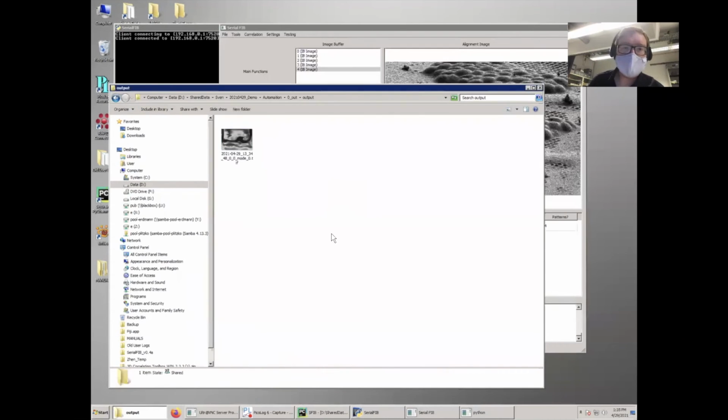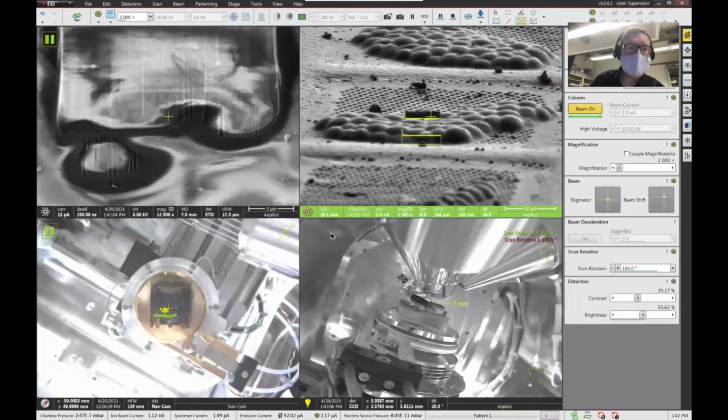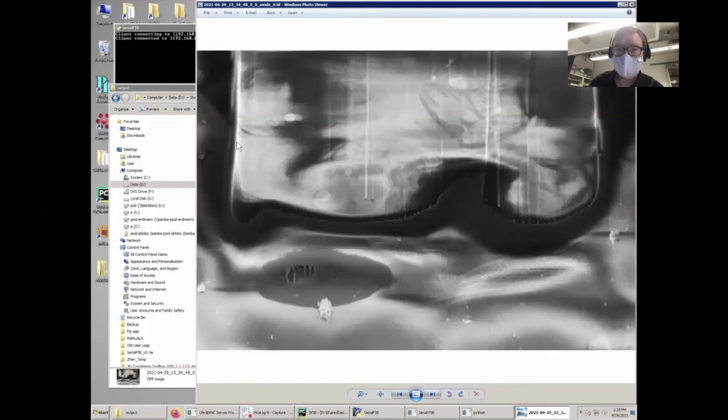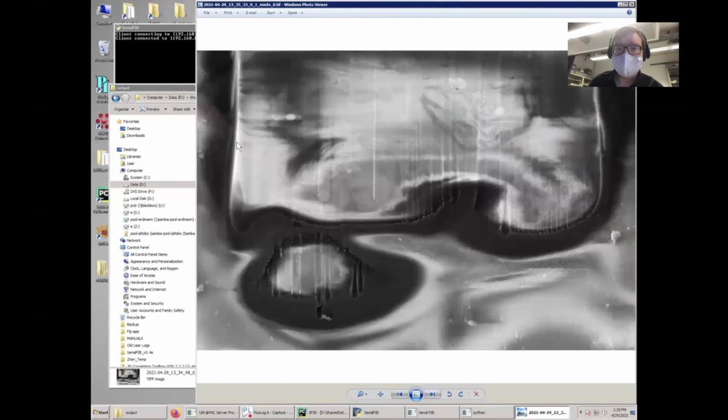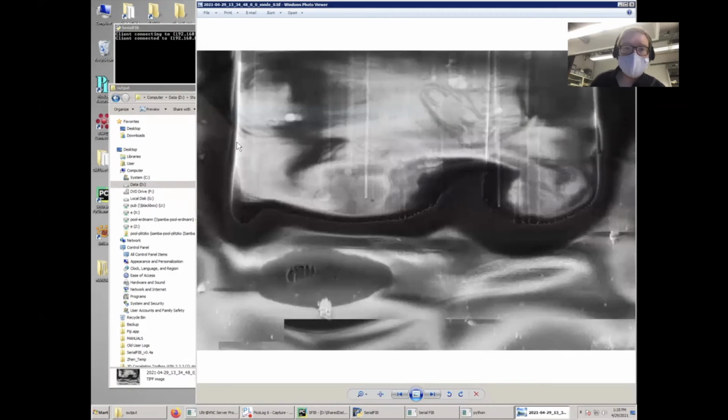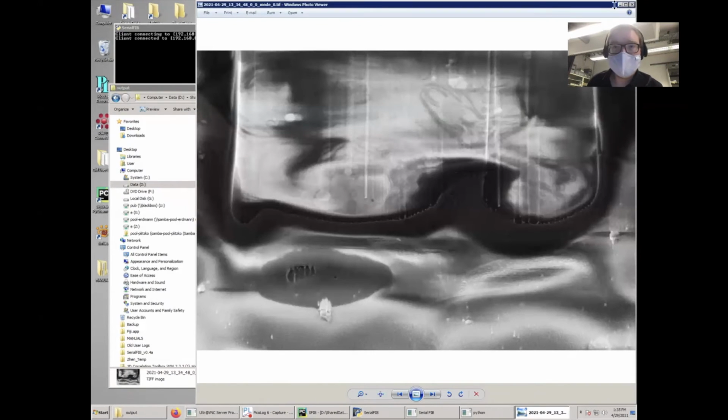And now let's just wait until there's at least a couple. And we're also providing the analysis scripts that we use to get rid of the curtaining, for example, and stuff like that. Yeah, great.